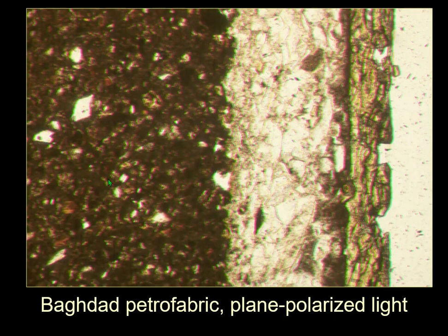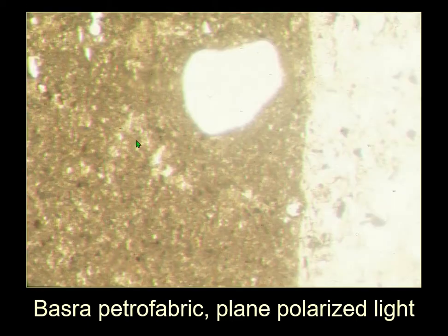So that's why this fabric, and I'm afraid this is a very old photograph, I've been working for the past couple of years at getting new microscopes with better photographs, and when I get those, I'm probably going to go absolutely crazy posting new photographs of all my petrofabrics. But in the meantime, you'll just have to believe me that this is that Baghdad fabric. This is actually a slip made of crushed quartz, and this is the lead glaze.